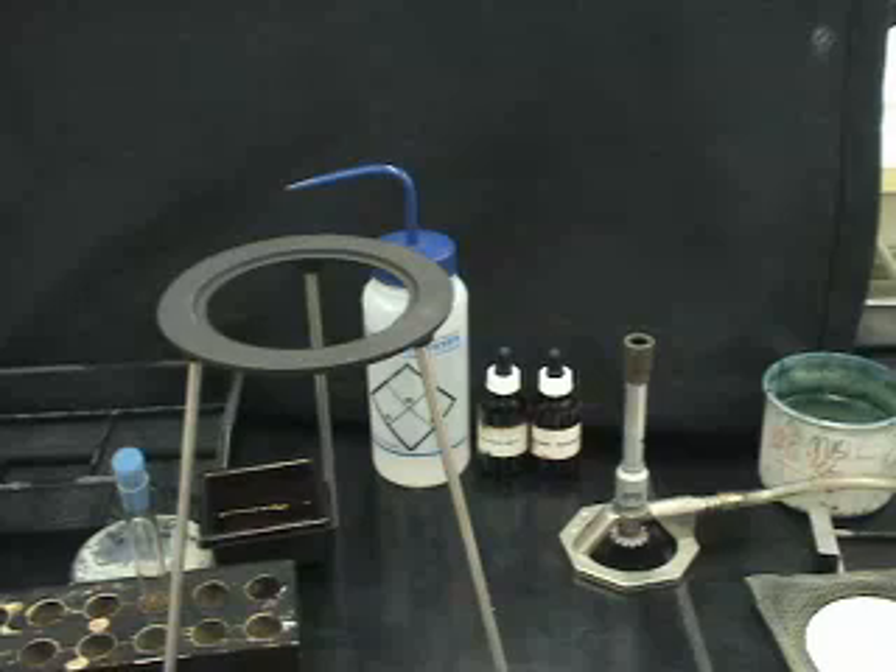Because a thick coat covers an endospore, it does not take up stain easily, and it is necessary to heat the smear in the presence of stain to force it into the endospore. After cooling, the slide is exposed to safranin in a second counter stain, which stains vegetative cells.